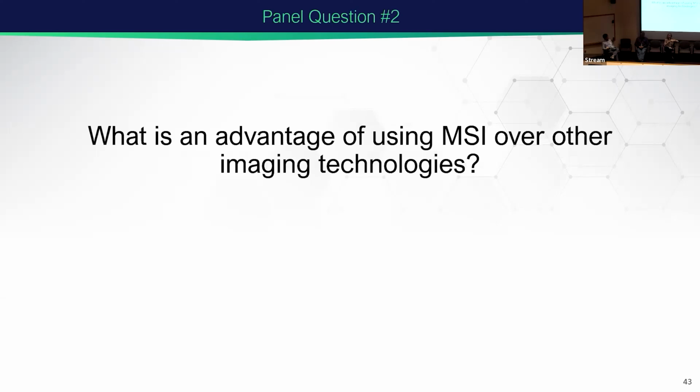So if you're doing a surface analysis, you don't have that extra separation. So we're starting to advance the technologies: maybe we're not going to do liquid chromatography, but we're going to do a gas phase separation. Or Kevin talked about DESI, where you're using that straw, feeding it solvent and sucking it up. Well, we have ongoing expertise here, so why don't we incorporate a little column in there? Why don't we include a little separation? As our sensitivity grows, and as the expertise grows in sample prep, we can get around some of that.